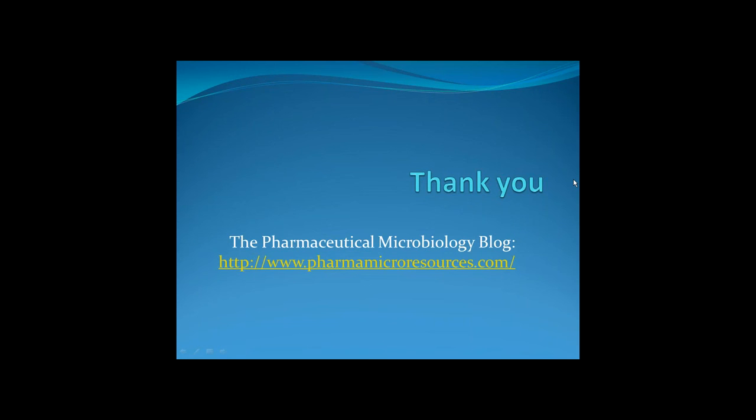Again, someone has also asked about the importance of sporicides and whether sporicides are necessary. And again, that's a tricky one, because there's also the regulatory response. So regulators are increasingly expecting to see sporicides used as part of the rotation. How often they should be used really comes down to the environmental monitoring results, and how often or not you're finding spores. So really that's something that you need to review the data and come up with your own defendable and defensible position.